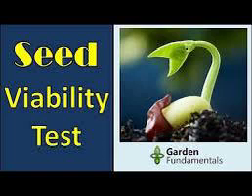Advantages: seed viability can be estimated in a much shorter time compared to germination test. It is used for dormant seed in combination with germination test. Useful test where seedling growth is extremely slow, particularly in some medicinal plants. The test requires a close examination of seed, and thus the seed analyst can often get an idea of the reasons for poor viability of seeds. Since dicot seed need not be damaged during tetrazolium test, the same seeds could be used for further investigations.